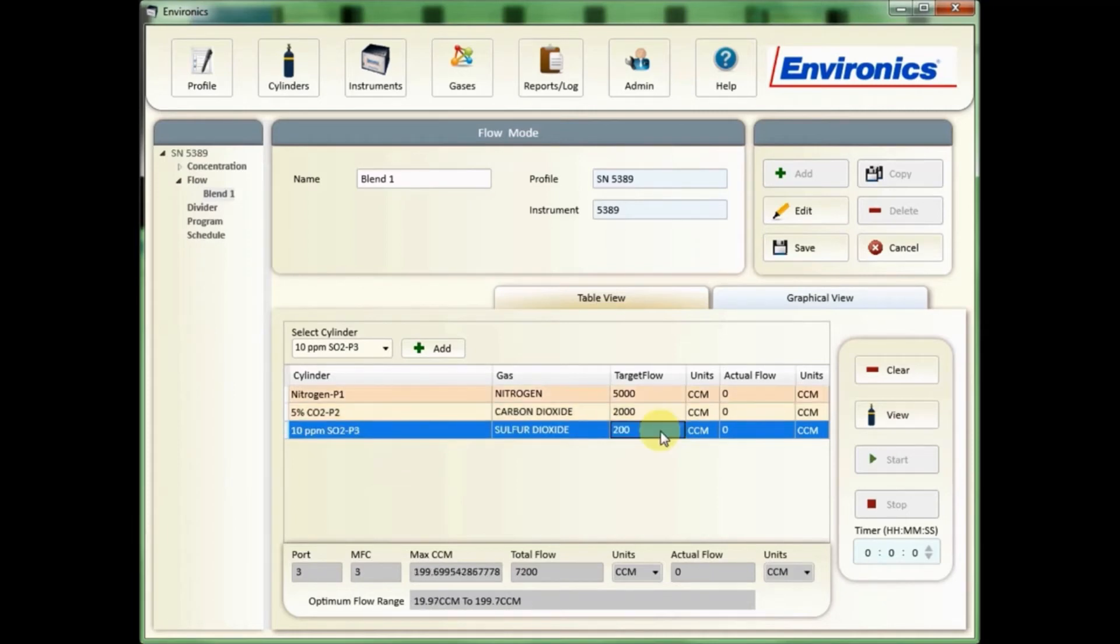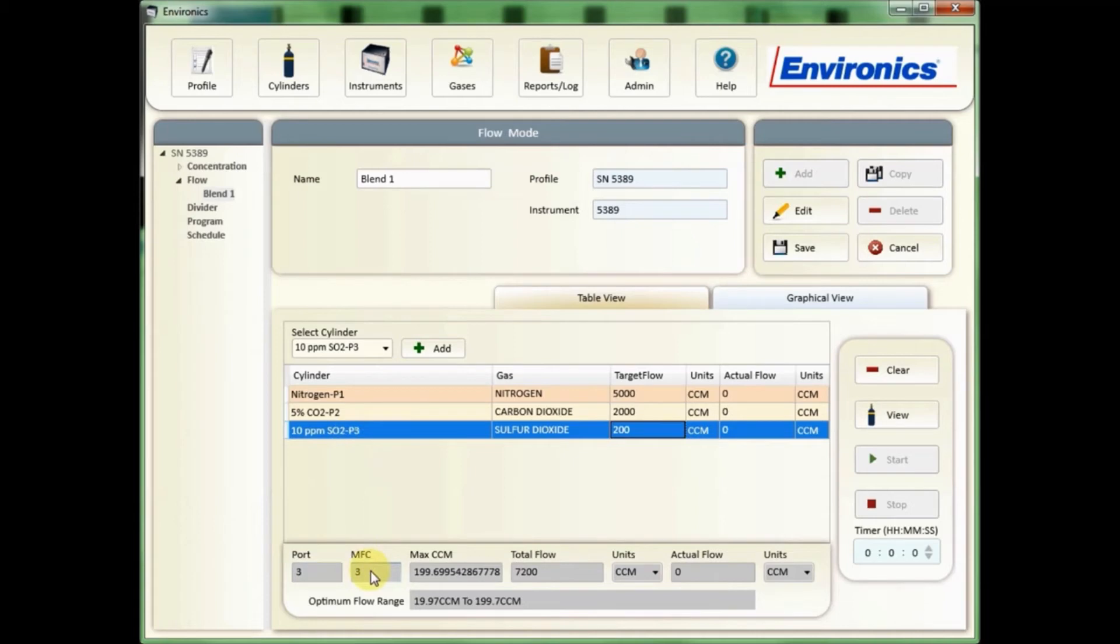Once these are all inputted, you can see here it'll show you not only which port you've assigned but also which MFC. So for 4000 this would be the same in most cases, but for 4040 or 4020 the unit will assign the correct MFC determined by which flow you select.